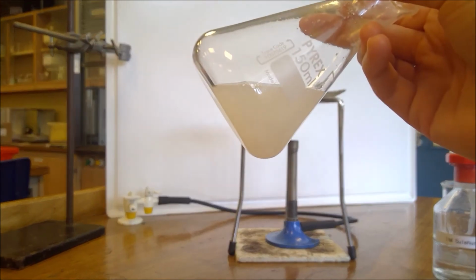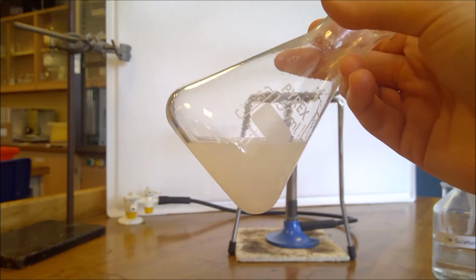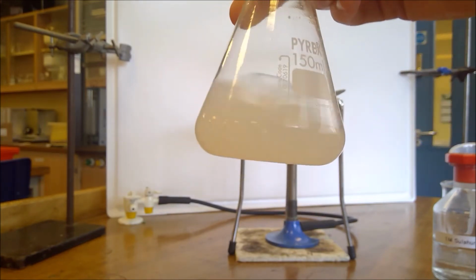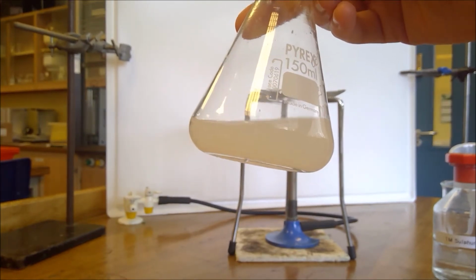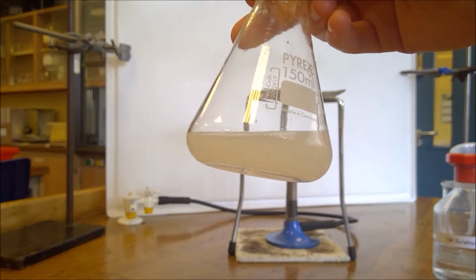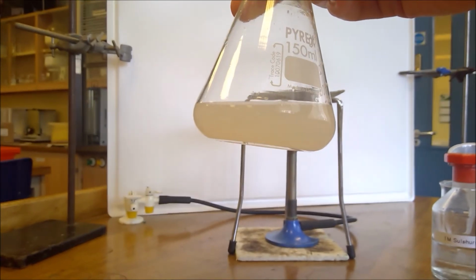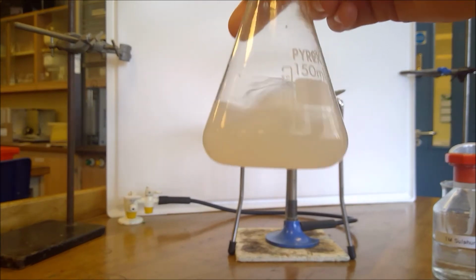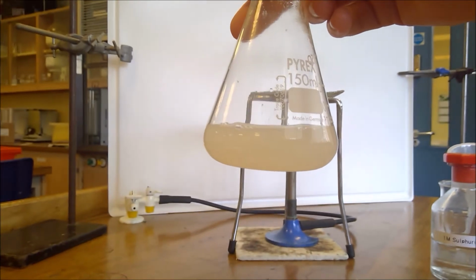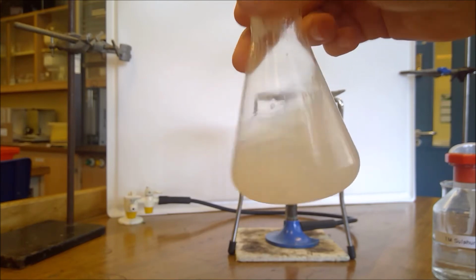Now you might notice on this last addition that we heard the effervescence, so we knew that some of our carbonate was reacting with the acid because we could hear the fizzing for the carbon dioxide being produced. But look at our mixture now. Every other time we were adding, you could see through the solution afterwards, so it was clear. So what we can say about our solution now, can we see that that's cloudy, or kind of milky colour? So what is then causing that milkiness? So what have we put in there?